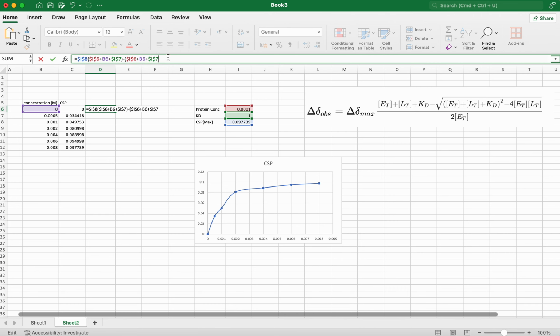So again, close the bracket, and you can see here this is under the square root, and all these parameters are added, plus squared. So I put square. Then this square, again I have the next equation, so I just close the bracket to make it a separate parameter.